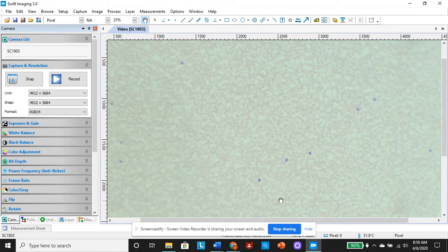Right now, what you're seeing in front of you is a blood smear of human blood magnified 100 times. All these little dots that you see in here, these are the red blood cells, all these little circles, and then all these little purple dots are the nuclei of some of your white blood cells. Right now we're on 100 times magnification, so that's 10 times through the ocular objective and 10 times through the microscopic lens objective. Now we're going to get a little bit closer.